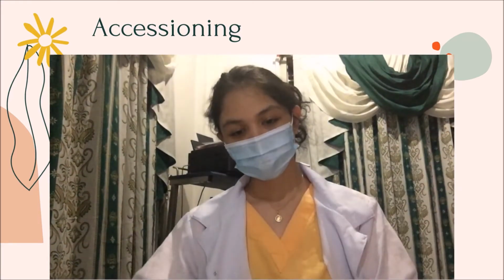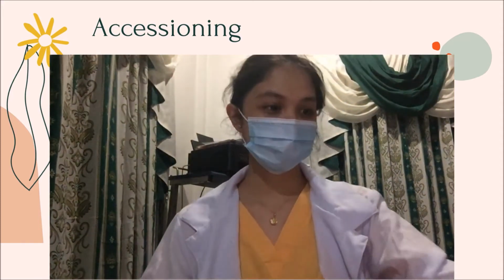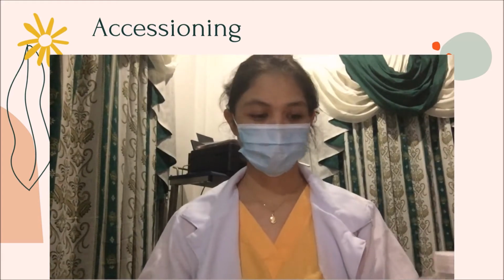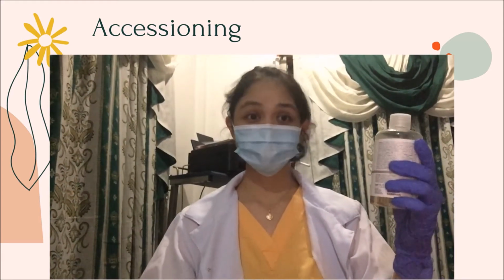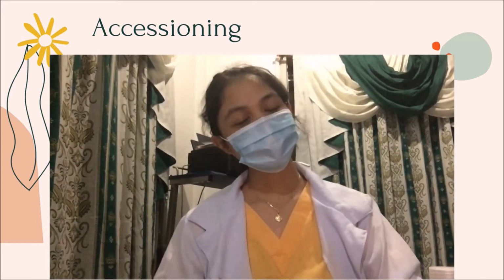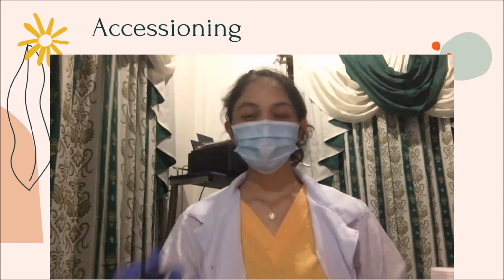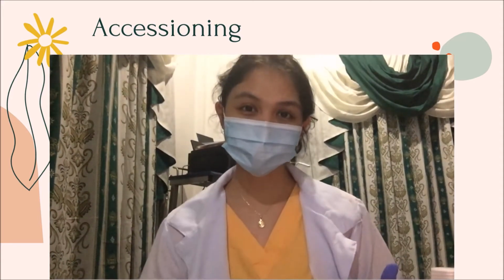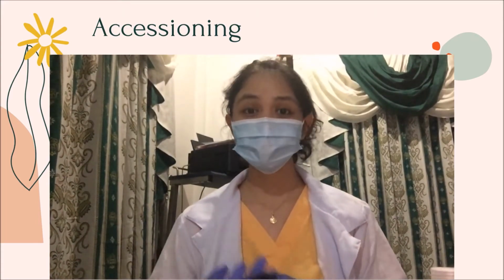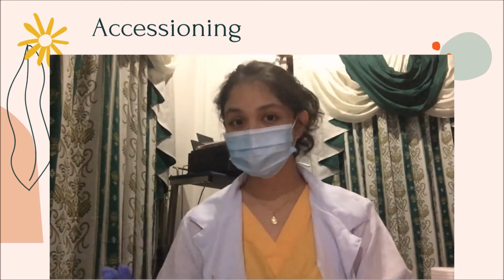So after going through the documents, it is now time for us to have this specimen labeled with a serial number. So this specimen comes with SP21143. So SP here means surgical pathology. So if it happens that you'll see a specimen with an AP at the first part of the serial number, it just means autopsy pathology. And we all know what autopsy means, right?